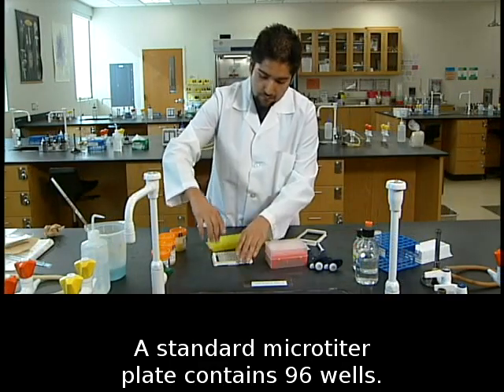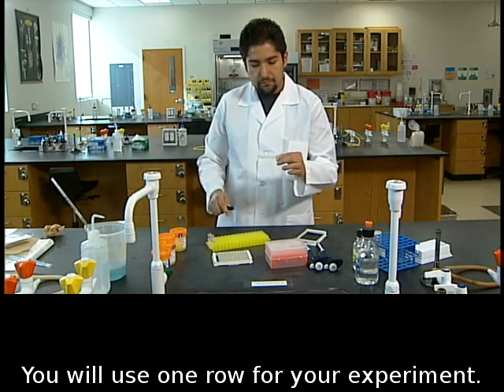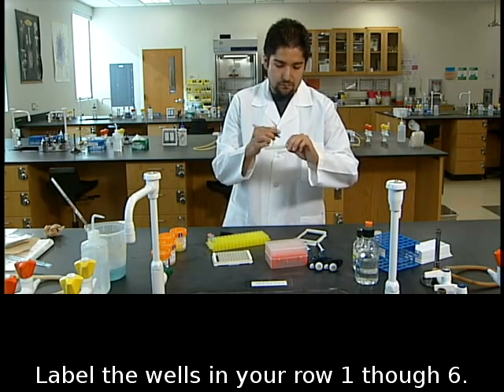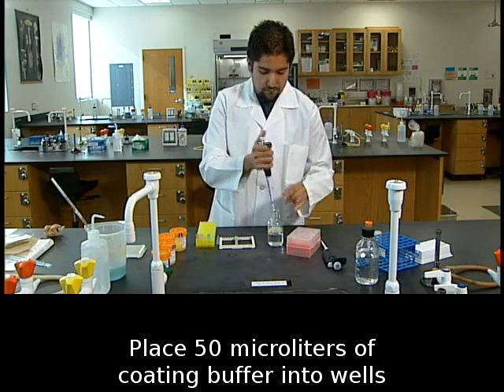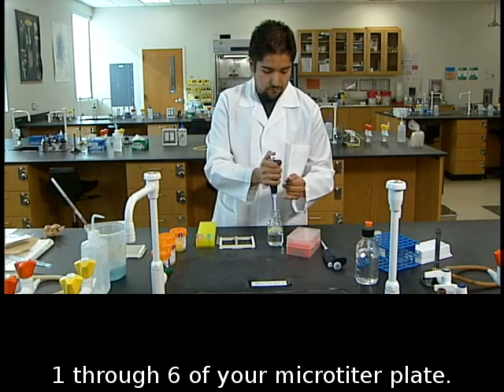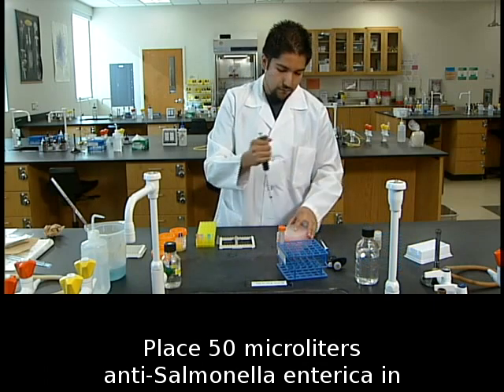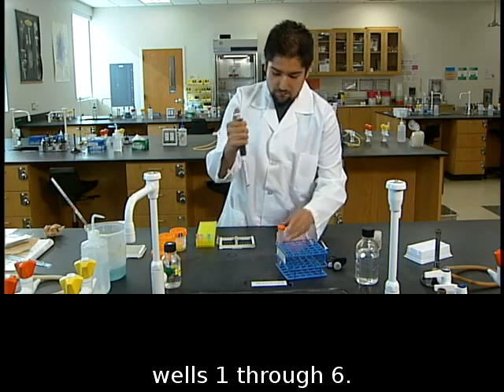A standard microtiter plate contains 96 wells. You will use one row for your experiment. Label the wells in your row 1 through 6. Place 50 microliters of coating buffer into wells 1 through 6 of your microtiter plate. Place 50 microliters anti-salmonella enterica in wells 1 through 6.